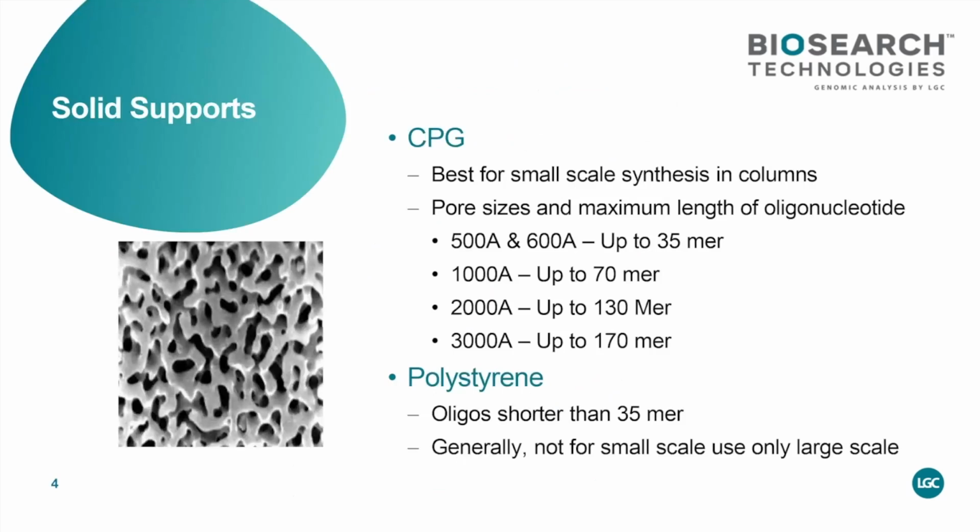What is CPG, or controlled pore glass? It's a little shard of glass. It's non-swellable. It does have these little grooves in it. This is part of the process to increase the surface area. The grooves come in different widths, so they call it the pore size.